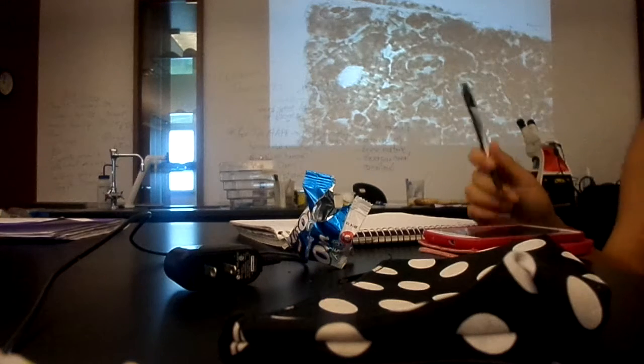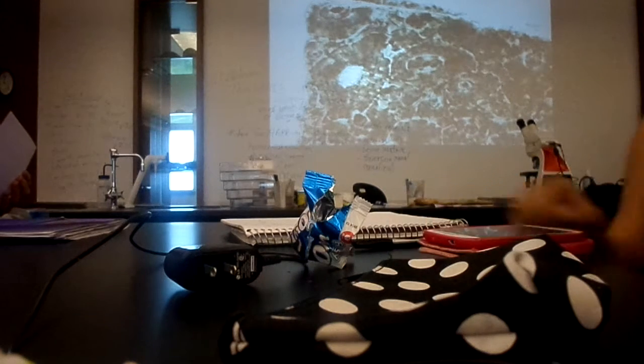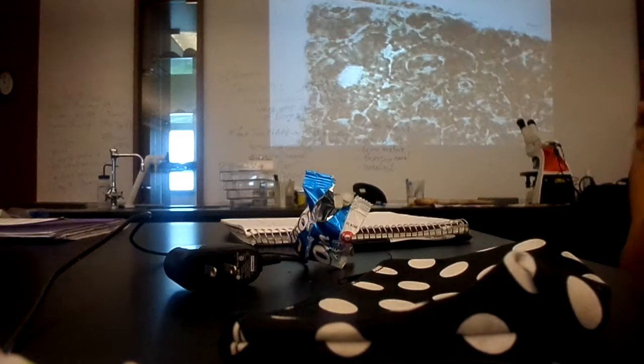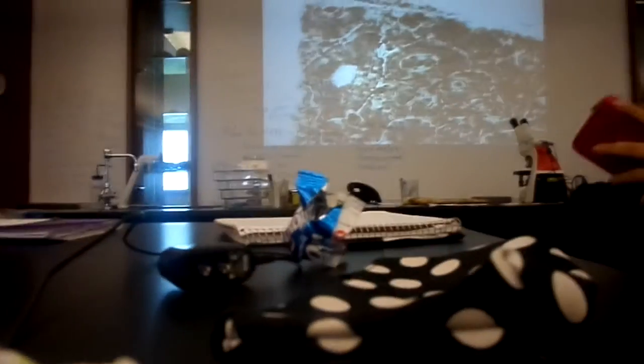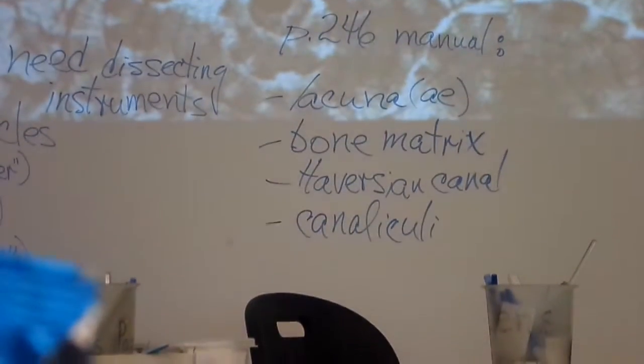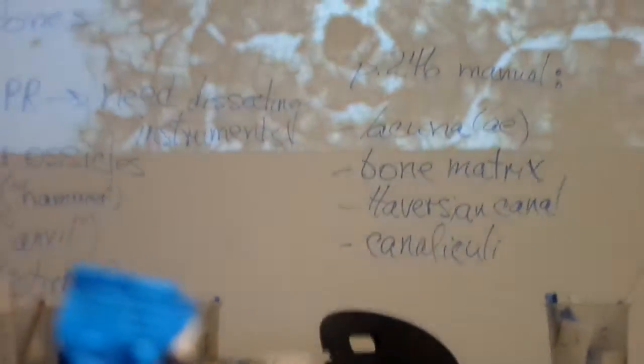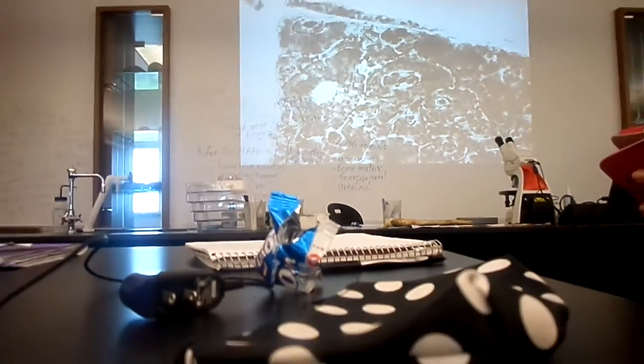Did I get the number right? Yeah, compact bone, 52. But it does come from a human being. But it wouldn't matter if it were from some other vertebrate.